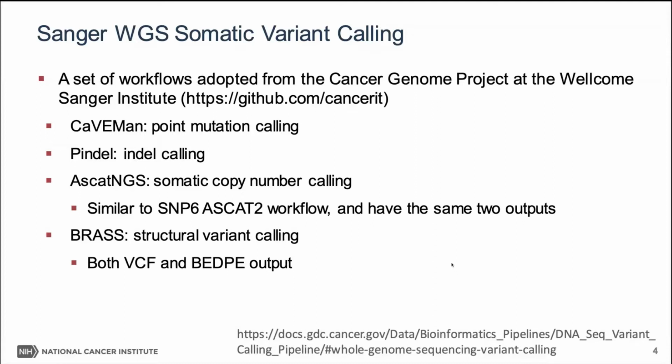VCF is also not as convenient as BEDPE, a tabulated format, for users to use. And BEDPE is something we expect most users will actually download and look into.